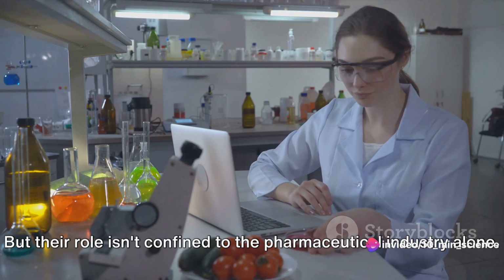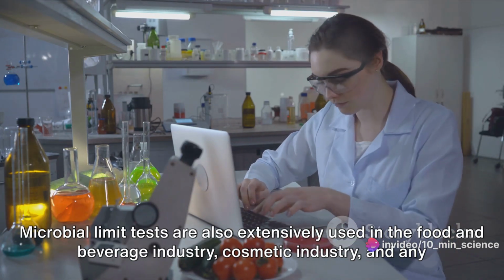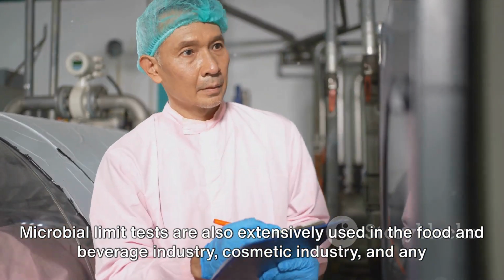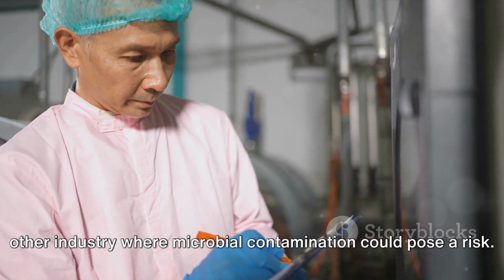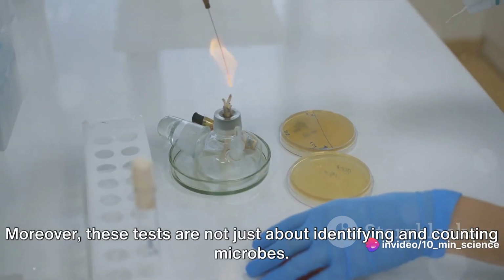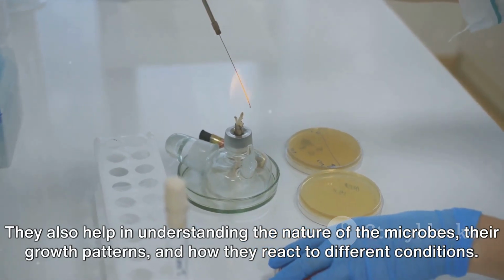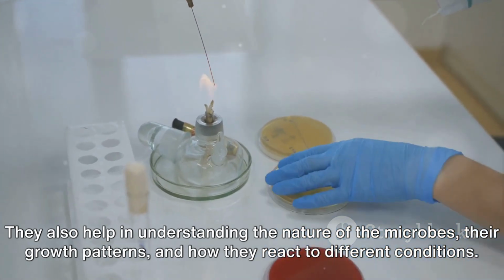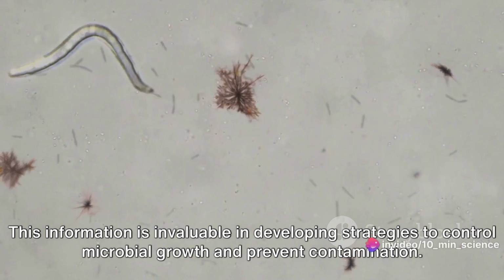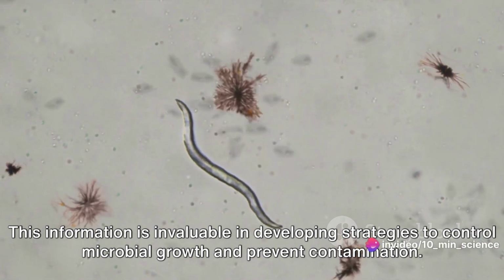But their role isn't confined to the pharmaceutical industry alone. Microbial limit tests are also extensively used in the food and beverage industry, cosmetic industry, and any other industry where microbial contamination could pose a risk. Moreover, these tests are not just about identifying and counting microbes. They also help in understanding the nature of the microbes, their growth patterns, and how they react to different conditions. This information is invaluable in developing strategies to control microbial growth and prevent contamination.